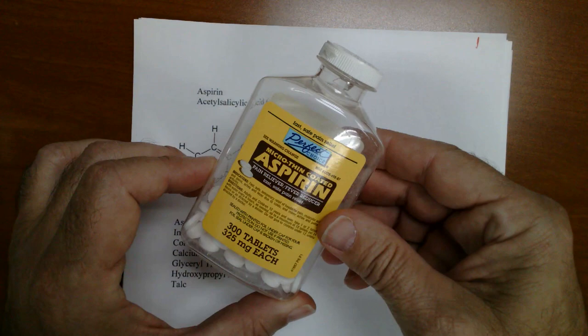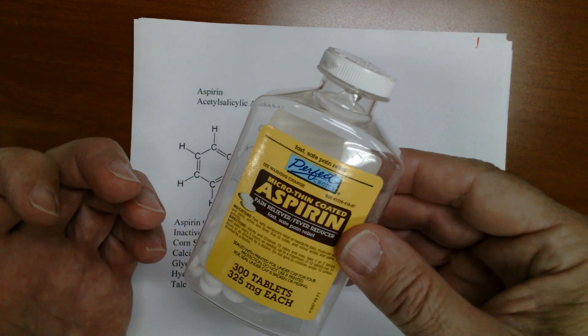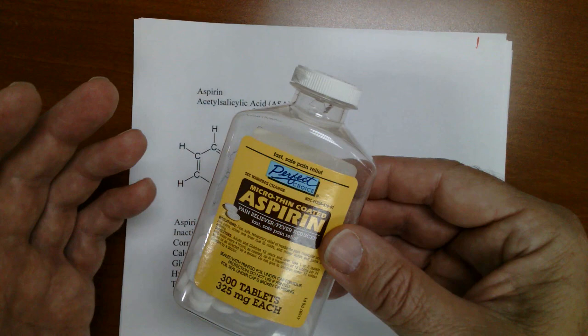So let's take a look at a bottle of aspirin. This is the aspirin we're actually going to test in today's experiment. And if you look at the aspirin, it says that it contains 325 milligrams of aspirin. Okay, so aspirin was originally a trade name by the Bayer company, but they've lost their trademark protection. So all sorts of companies can make this product and actually market it and sell it as aspirin.